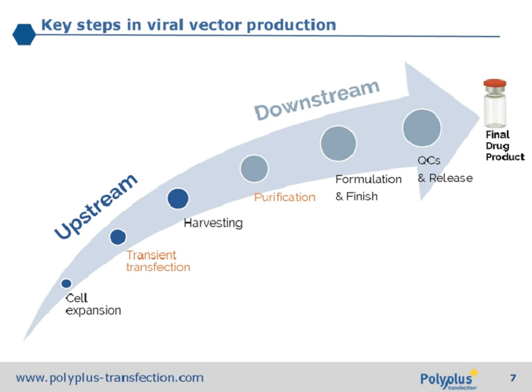So what are the key steps in the manufacturing process that one should focus on to maximize viral titer yields? In the upstream process, it is the production amount reached, which mainly depends on the transfection method used. And this will be the focus of today's webinar.